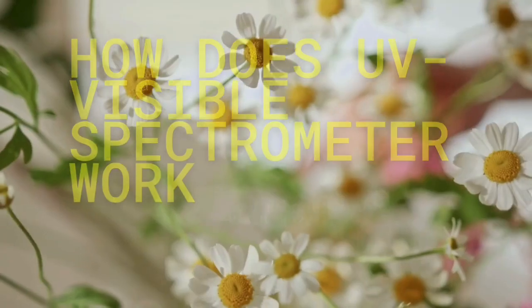A 3.5 milliliter cuvette was used to contain the extraction and the ethanol separately. In order for us to get a spectrum for the green dye, we first must get a base reading of the solvent that we use. That's why the 3.5 milliliter cuvette of ethanol was used to get the base reading, because we use ethanol as the solvent for our extraction. After we get the base reading, we can use spectroscopy to get the absorbance value for our green extraction dye.